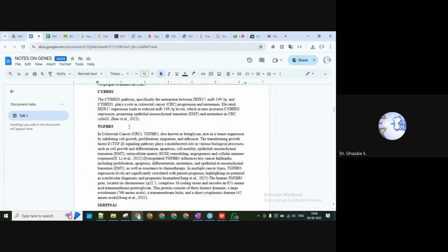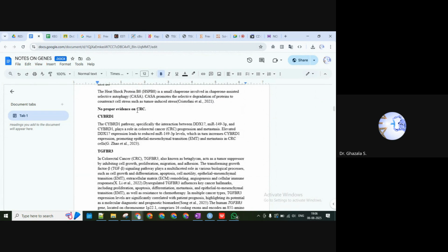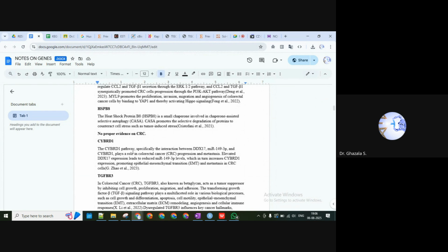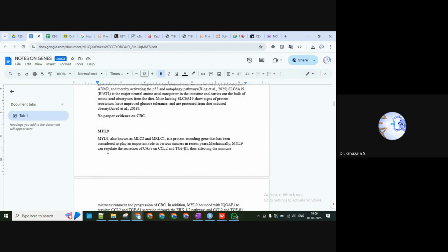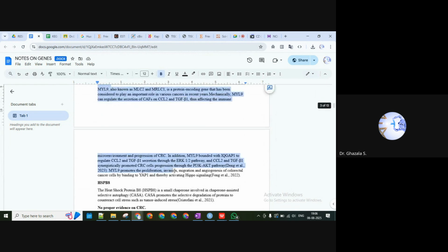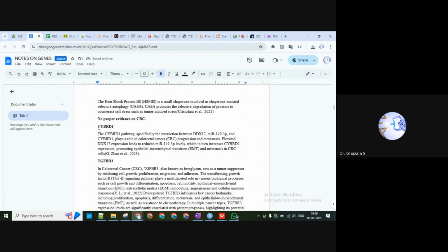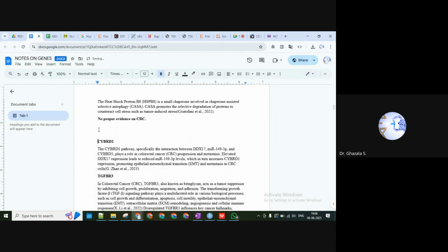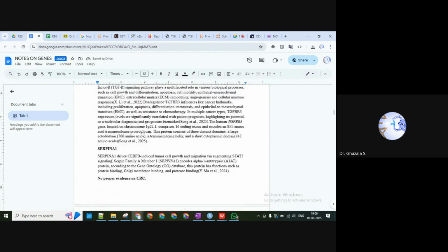For most of the genes there is no such publication or data available. But for the genes for which data is available, we can check those first, because accordingly we can work with them, and handle the novel genes separately.